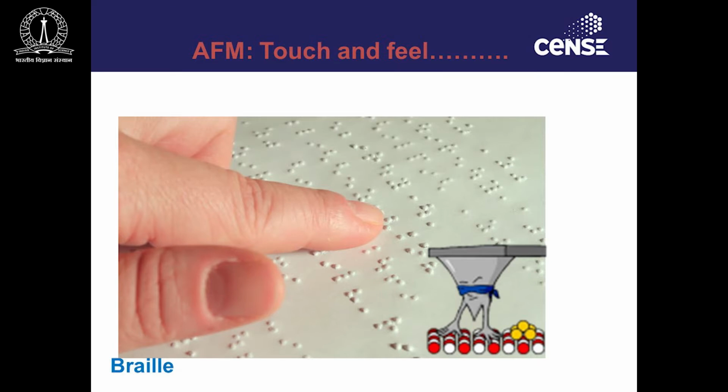So what can we relate this atomic force microscope to from what we see in our daily life? If you have to give an example, this is one such very good example. Everyone knows about this. This is Braille script, and we do not use it, but blind people use it. How do they use it? They feel across the surface, and skin being a very good sensor, it is able to see what is on the surface and send a signal to the brain, and the brain generates an image which is very similar to the atomic force microscope's generation of an image. So this is a blind tip that is represented here.